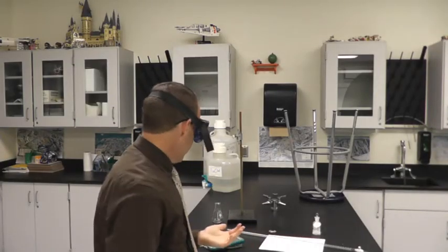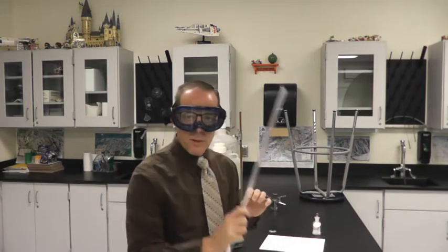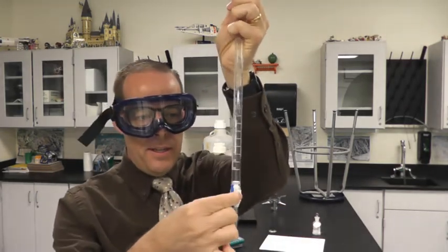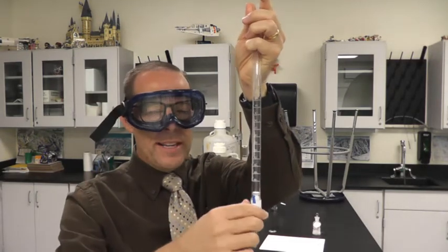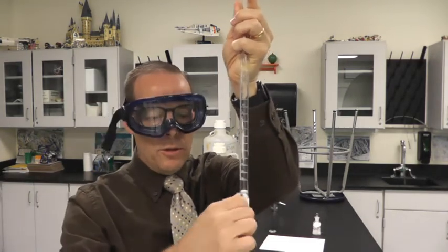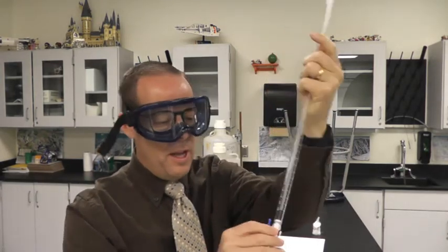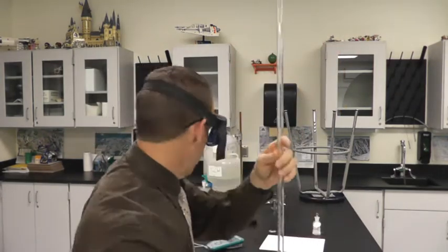So titrations basically go something like this. This is a burette. This guy right down here, it's called the stopcock. If it is parallel with the glass, it's open. If it's perpendicular, it's closed. So it doesn't like, it's not righty-tighty, lefty-loosey. You can go either way with it. Hopefully we'll use these second semester and you're back in.